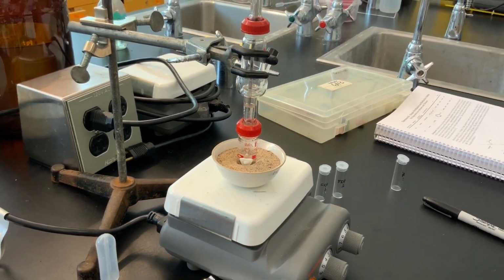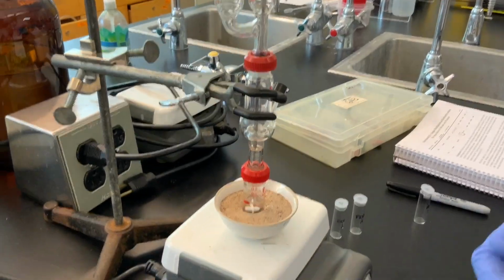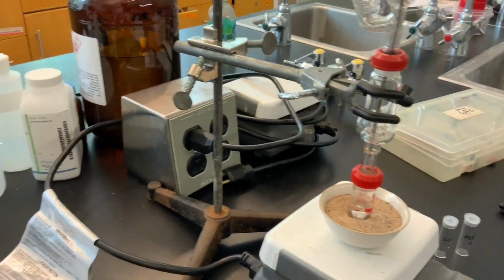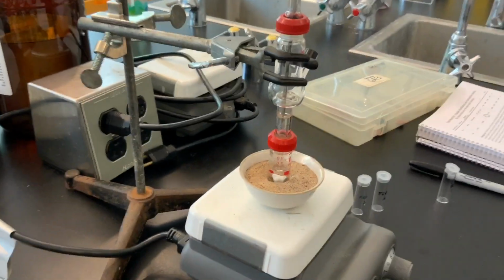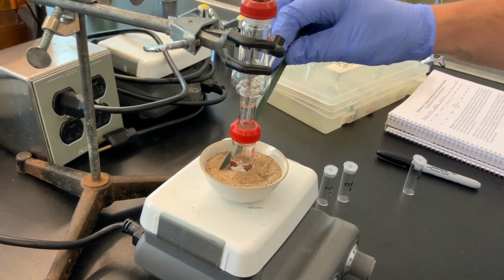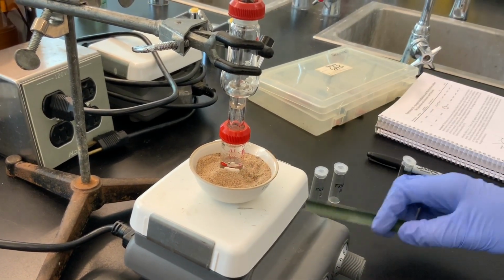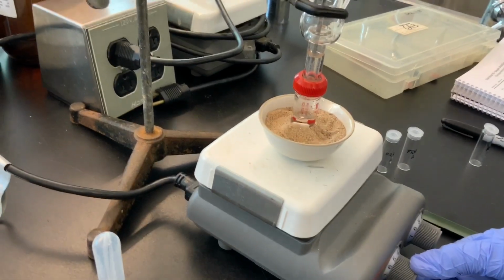And what we can do is use a little spatula. Let me grab one. To help push some of the sand and try and maximize the amount of heat being transferred to our reaction vial.